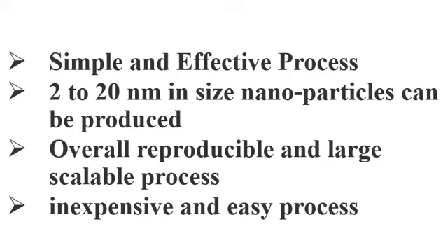Once you have the bulk material, you just convert it into a nanoparticle by crushing it. So in simple words, ball milling is an inexpensive and very easy process.